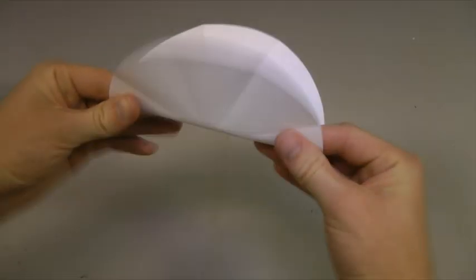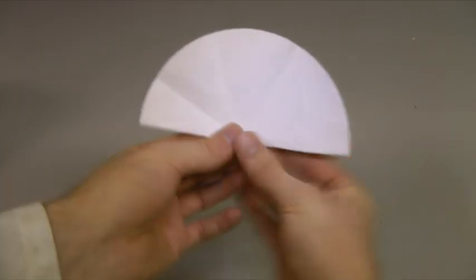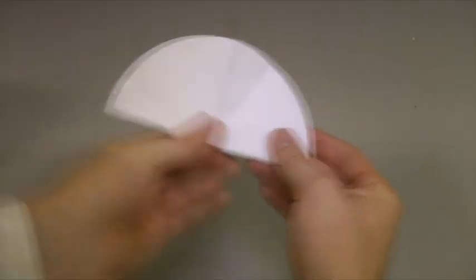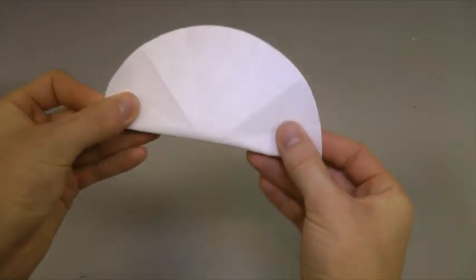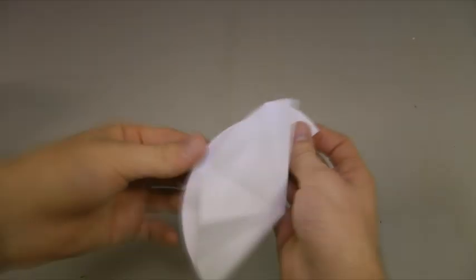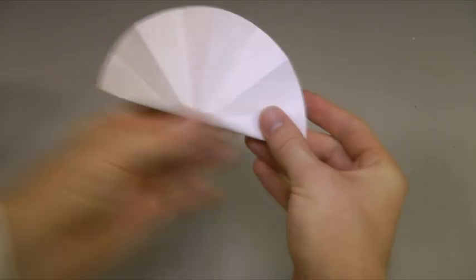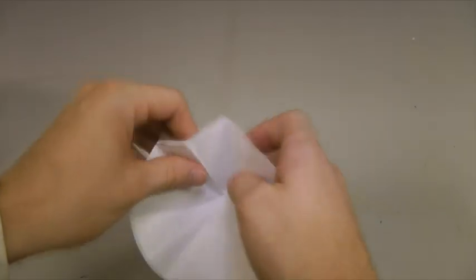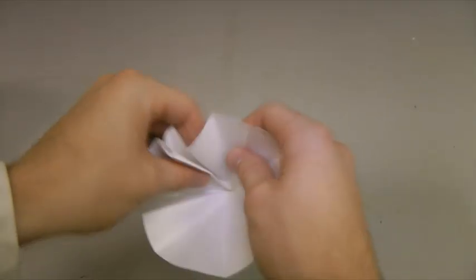You now need to turn the filter paper over and add four folds between the folds you've already made. Your filter paper should now be folded into 16 segments, with each alternating fold being in the opposite direction.